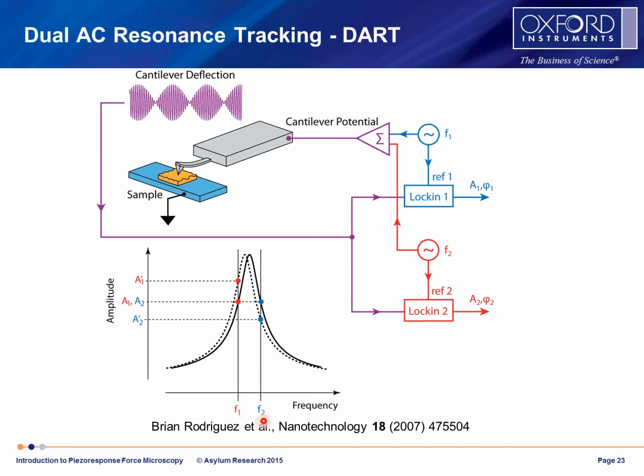If we have F1 and F2 as the frequencies, and our original contact resonance is this solid black line here, we choose those F1 and F2 drive frequencies such that A1 and A2, the observable amplitudes, are the same. So the difference between those two amplitudes is 0. They should be identical at that point, or close enough to it.